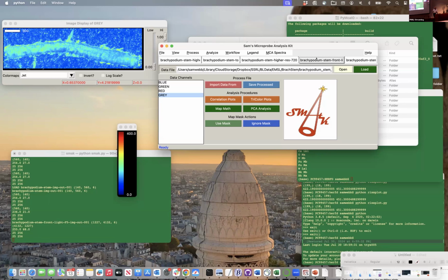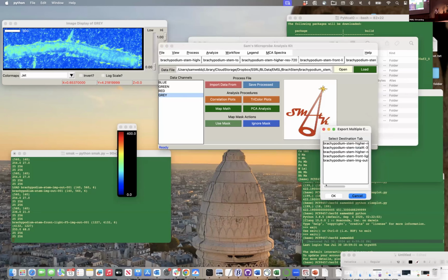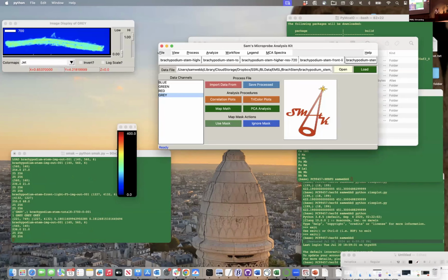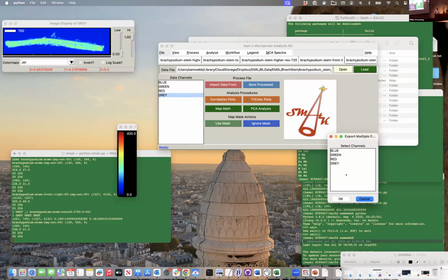When I get back on Friday to SSRL, I'm going to put the new high mag camera on all the beamlines, and so this will be less of an annoying issue. But it's a good example of different camera resolutions, different CCD resolutions, and how well or not well things work. So we will export with resize in the grayscale channel, and we'll shoot this over to our 14.3 data. That's it, yep. And we'll take this over here, and we'll export with resize and shoot the gray channel.